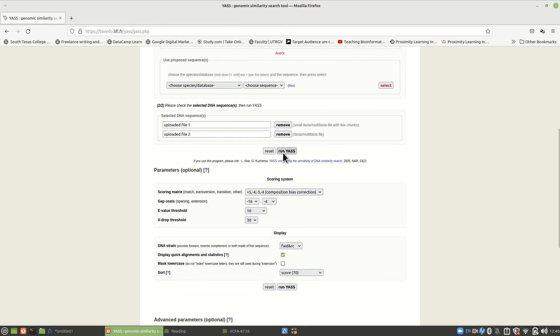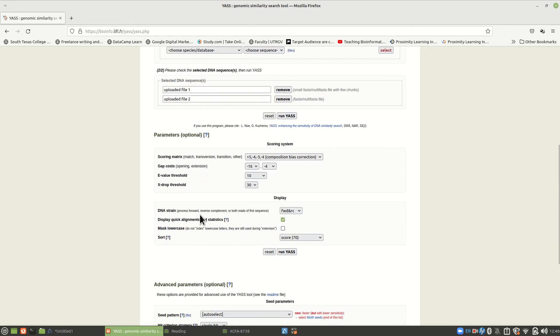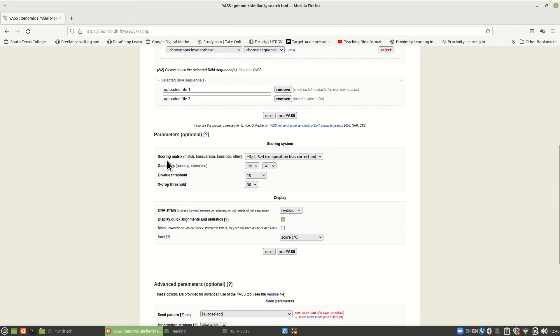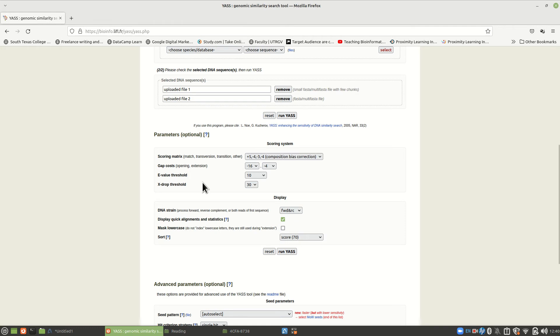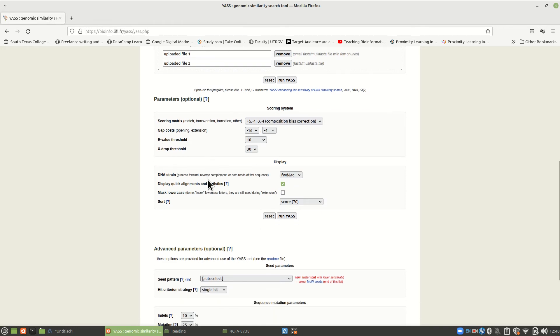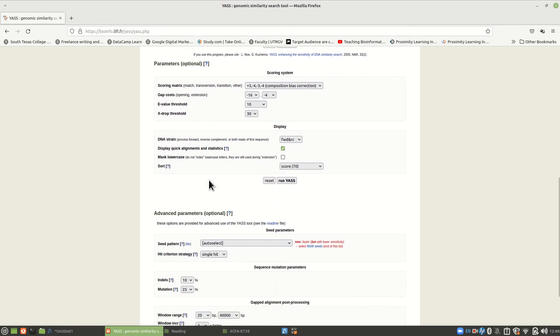Now, we could run YASS now. But there are some parameters down here that we want to set. This is very similar to dot plot. We're going to compare these two. We can choose certain things. Just leave this as the default. I may or may not get around to explaining these things to you. We will learn about E-values later, but not here.